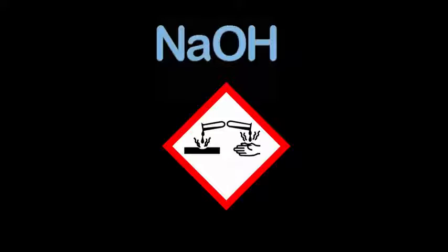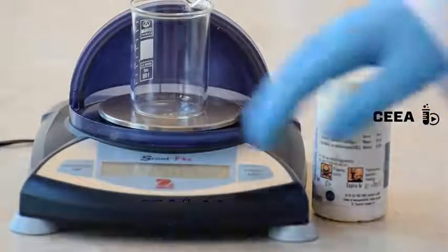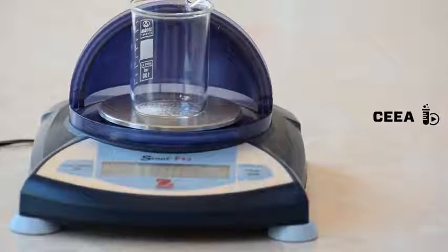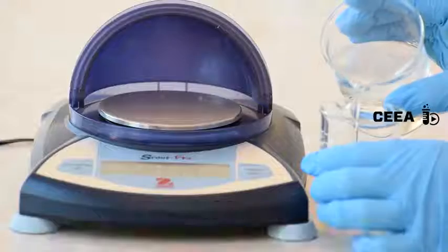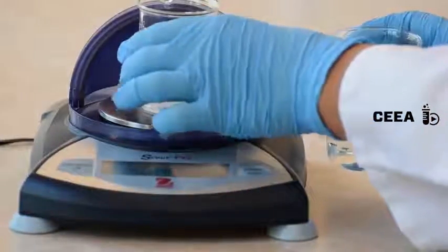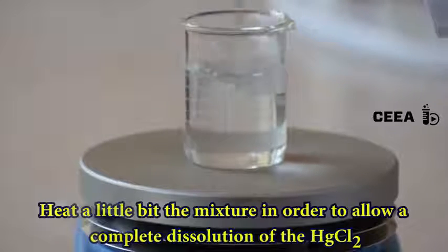Sodium hydroxide is caustic. We start our experiment by weighing 4.4 grams of mercury-2 chloride, known also under the name of corrosive sublimate. Add 70 grams of water and heat the mixture to allow complete dissolution of the chloride.